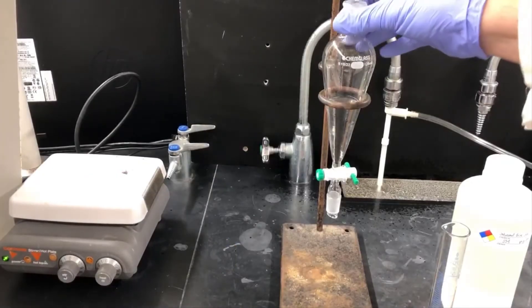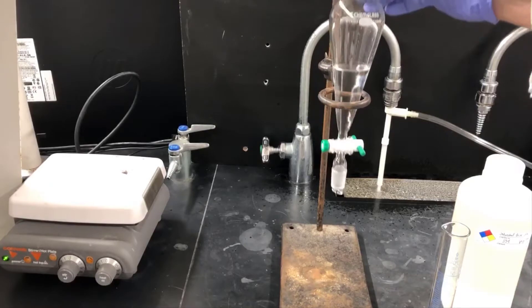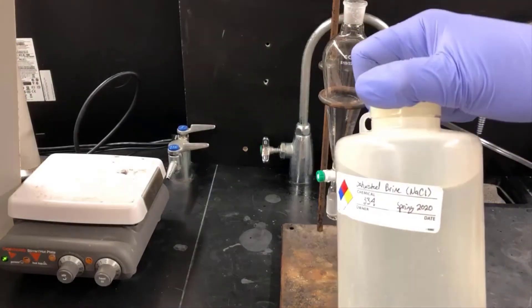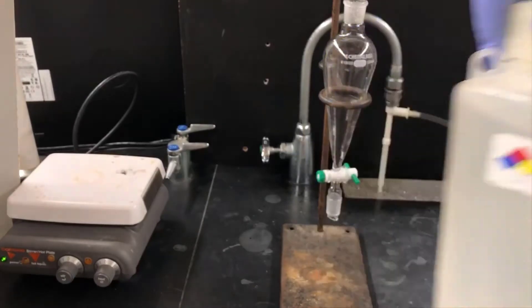The solution in this separatory funnel contains caffeine dissolved in ethyl acetate. It may also contain a little bit of water, so I'm going to wash this solution with saturated aqueous sodium chloride solution, or brine.